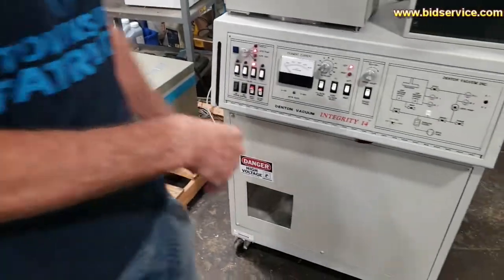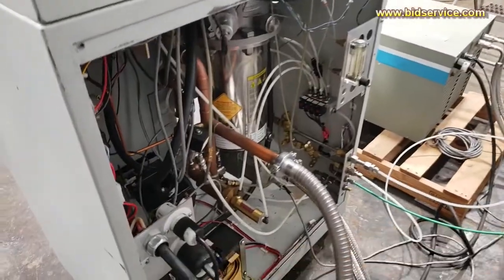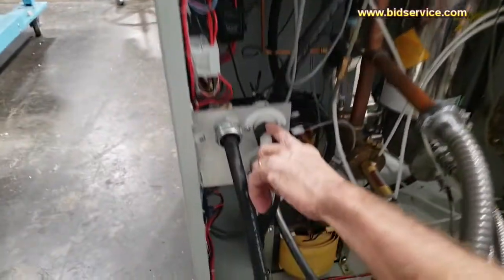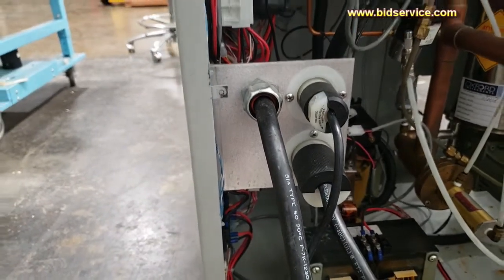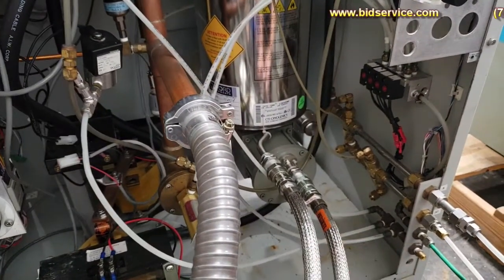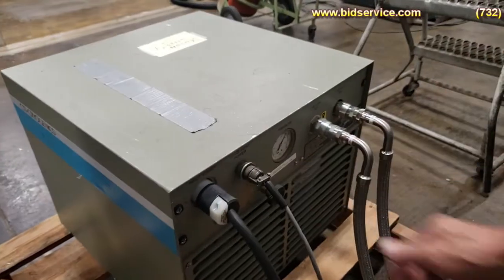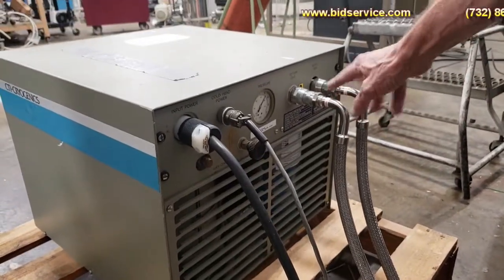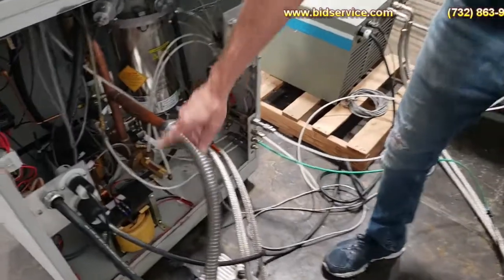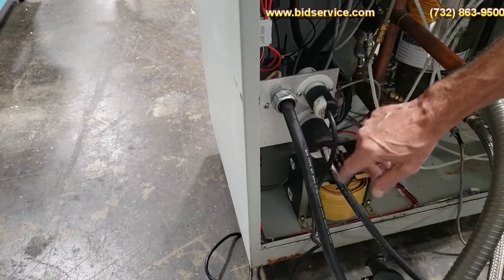The compressor is powered through the back of the unit with a 208V plug. You also have a 208V plug for the mechanical vacuum pump. You'll need to hook up your cold head and two cryo chiller lines coming in, marked supply and return. On the other side is your power in — a four-wire, 208 single-phase with a neutral and a ground.